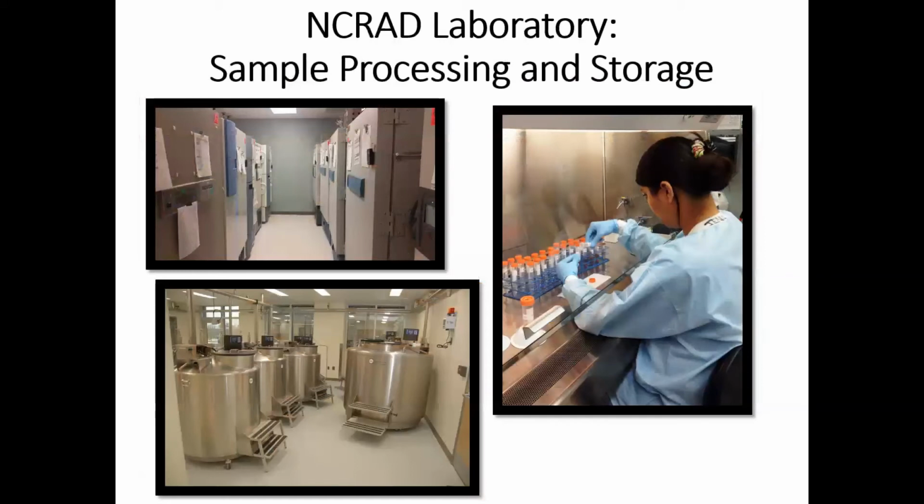Here at NCRAD, after we receive the samples, we do sample processing and storage, as you can see on the right. You can see that we have a number of freezers and also liquid nitrogen tanks where we're able to store samples as well.